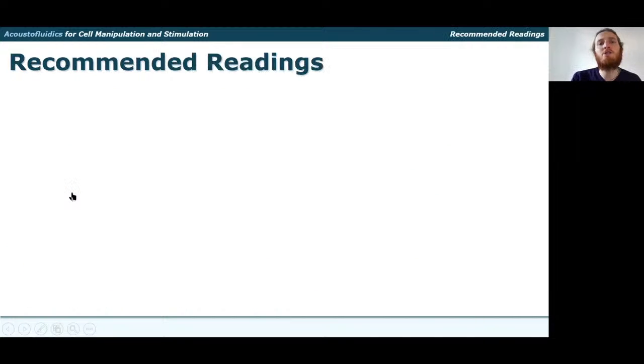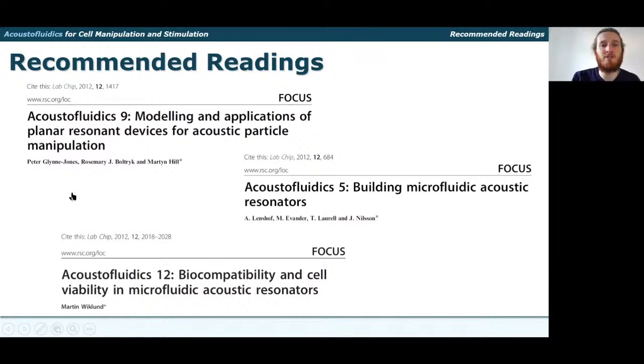So in conclusion, in addition to the different references that were mentioned along the presentation, if you are approaching the field of acoustofluidics, I highly recommend reading the Acoustofluidics series. And particularly, there are articles that deal specifically with the design, modeling, construction, and also biological compatibility of acoustofluidic resonators.